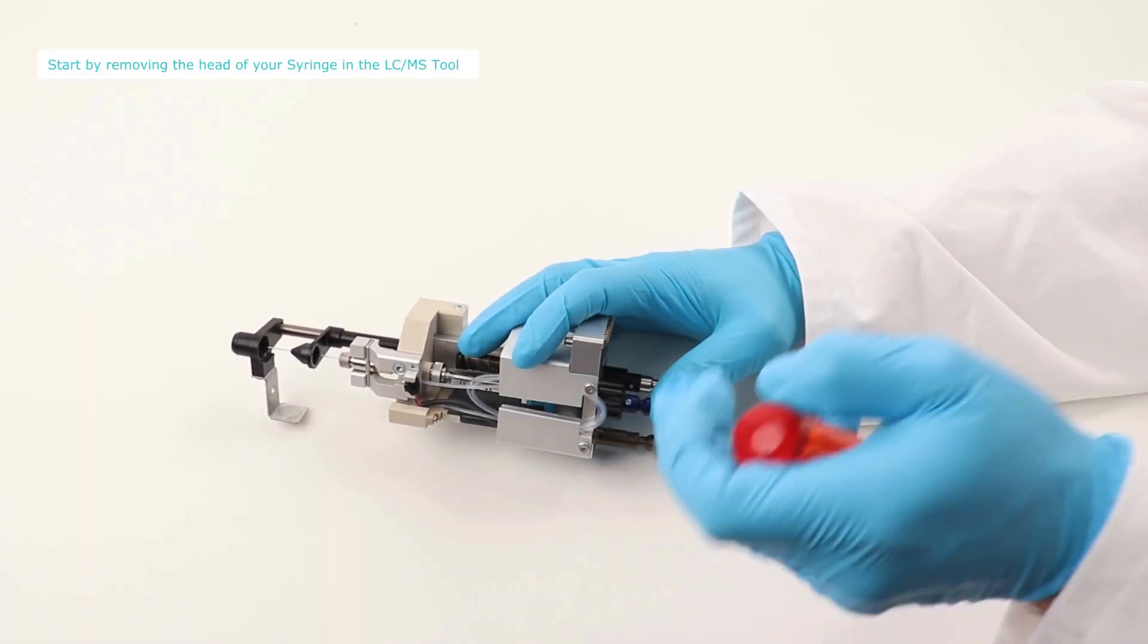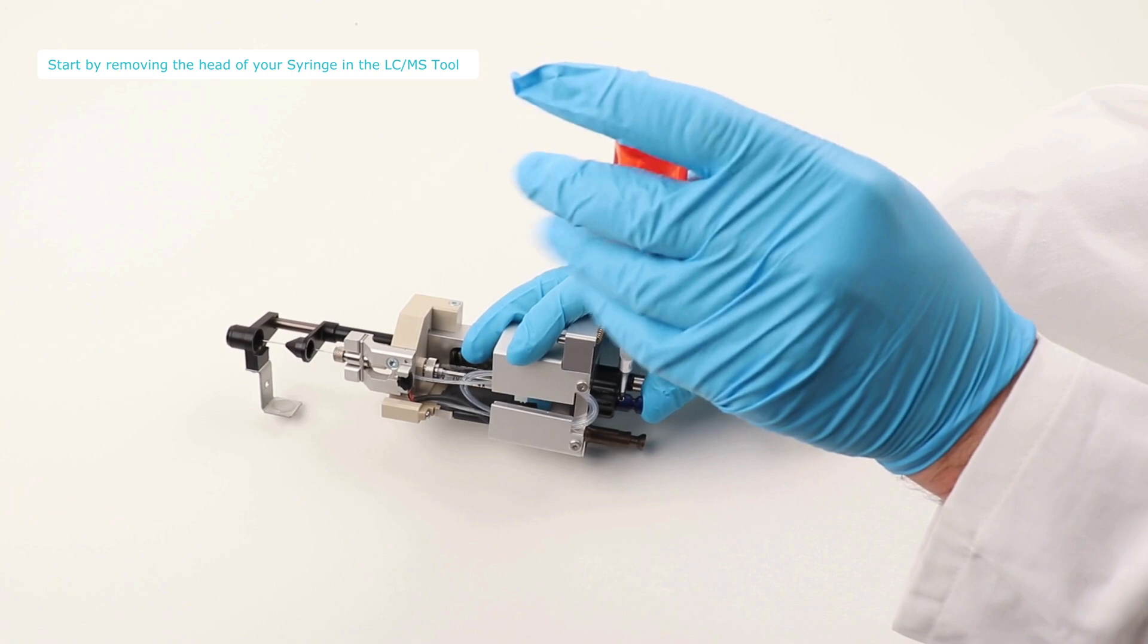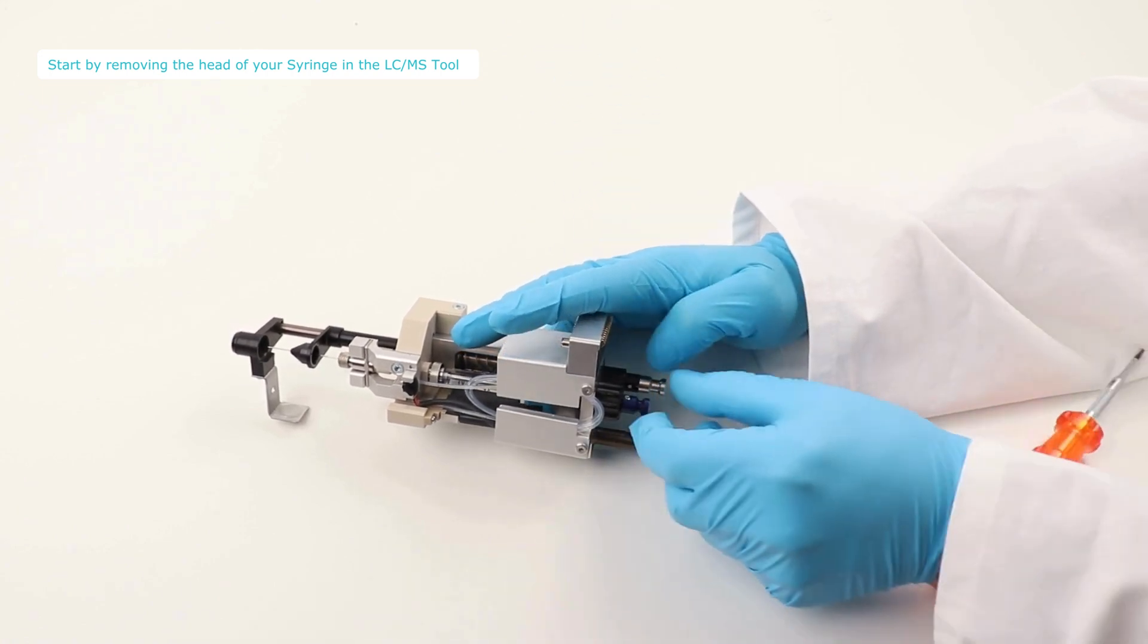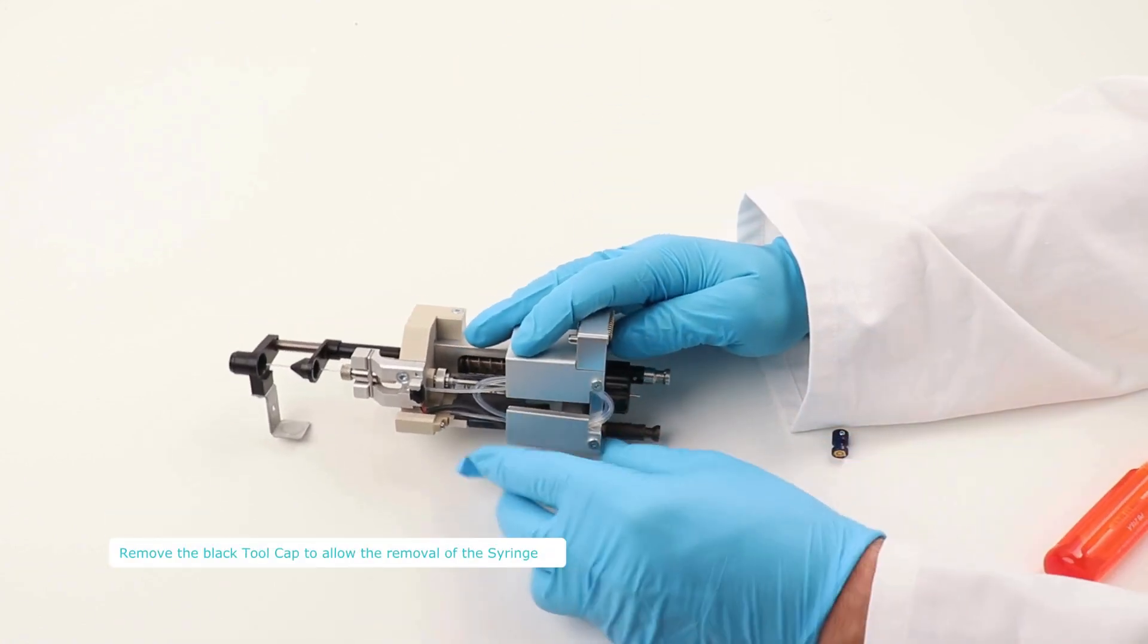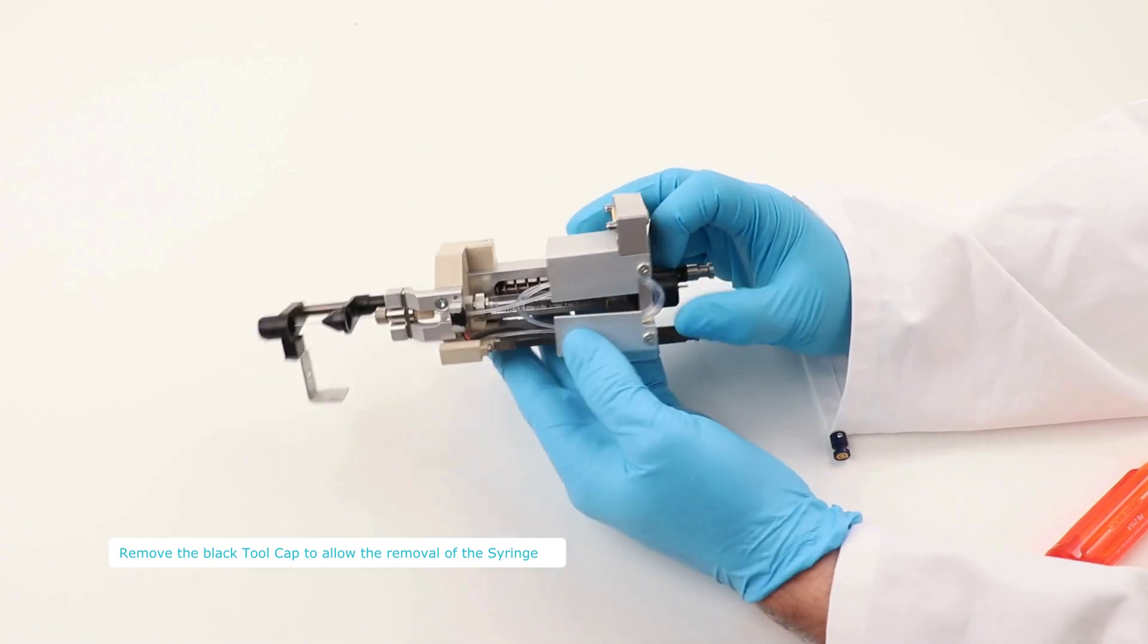Carefully detach the LC-MS tool from the PAL system. Next, identify the syringe head screw and unscrew it to remove the head, revealing the plunger.